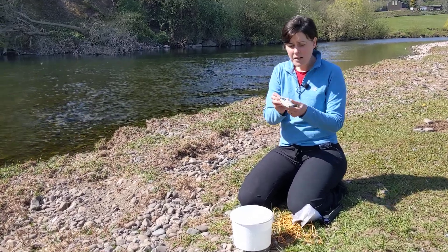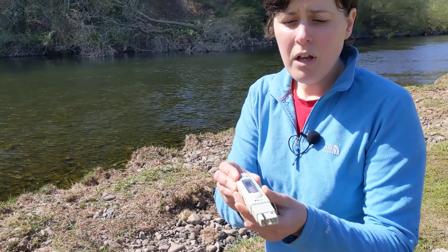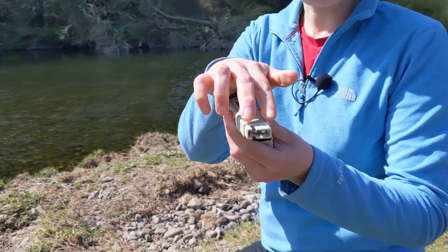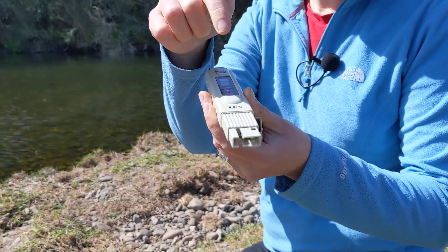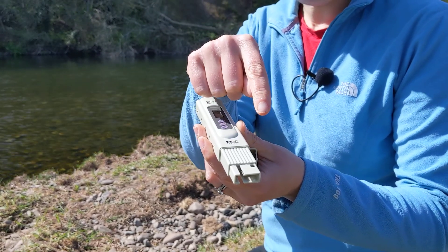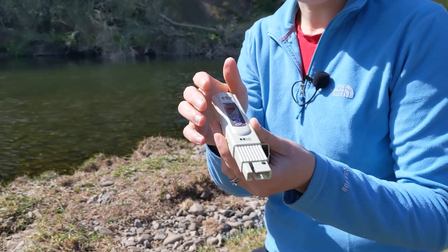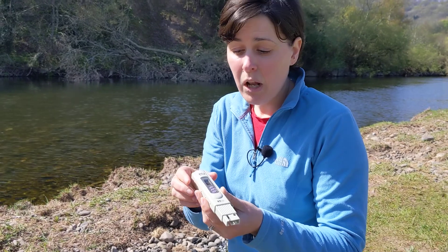The way the meter works is at the bottom here — remove the cap — and you can see there are two little prongs at the bottom. An electrical current is passed between those two prongs. If there's lots of stuff dissolved in the water it's easy for the current to pass and you have high conductivity. If there's not much stuff, it's harder for the current to pass so you have low conductivity.